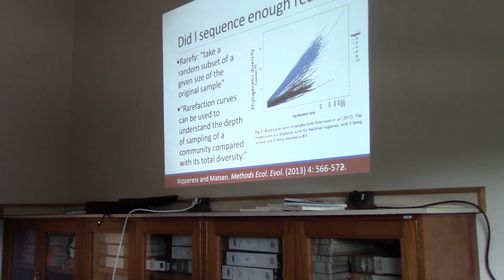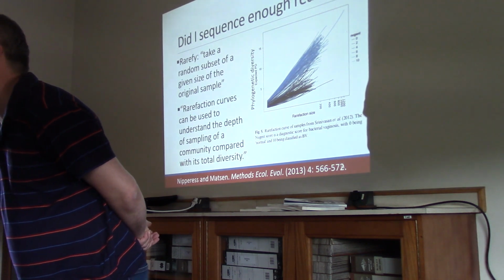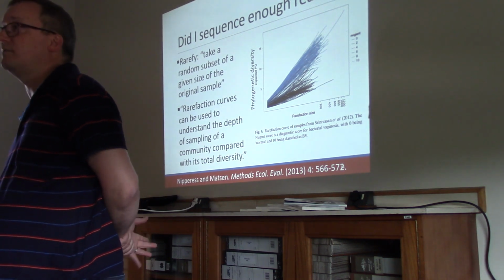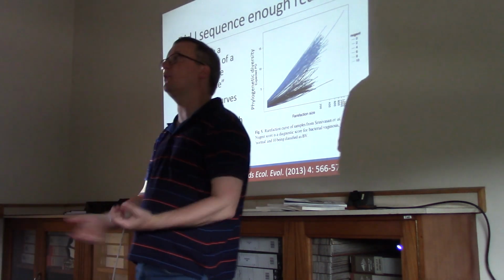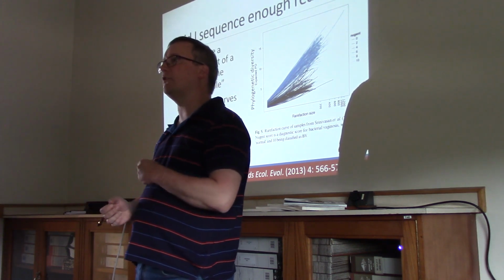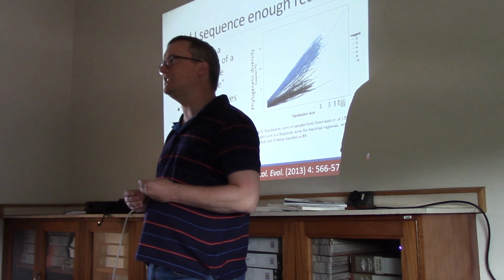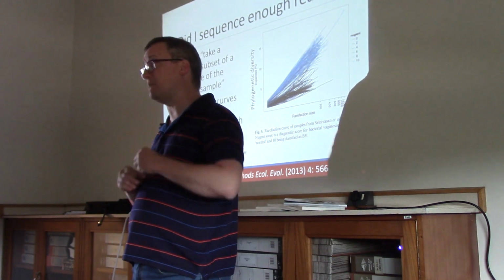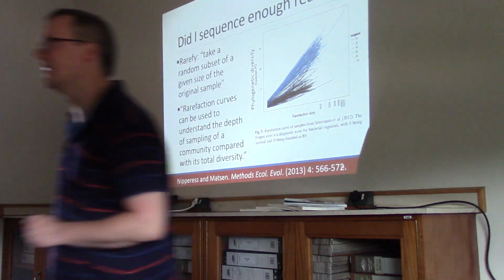Yes, question? You say when you use it in the chapter with depth coverage when you want to look at coverage of your proteome. Yes, depth of coverage is sensitivity in that context, yeah. So if I am subsampling a proteomic data set, I am asking how much my IDs change if I grab some subset of the PSMs for making that judgment. Ideally, the number of proteins is not going to drop a whole lot, but the sequence diversity, the peptides that we see, probably will fall quite a lot. Good question.